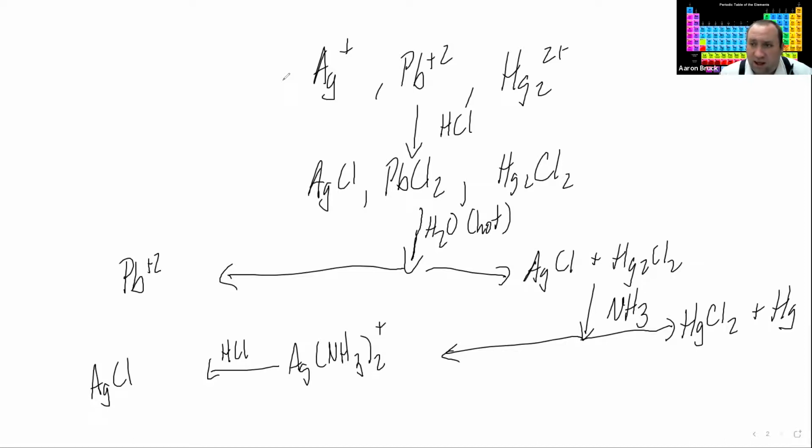The point of the second day is we will give you a solution of an unknown nature that is going to contain a combination of these ions. And your job will be to identify, okay, this ion's present and this one's not, and here are the reasons why.